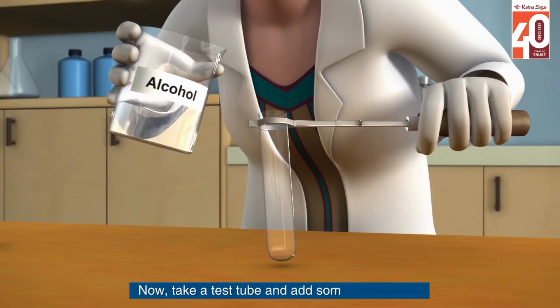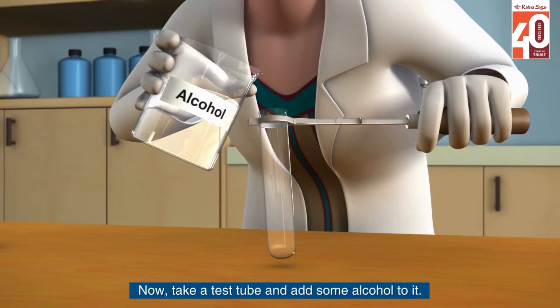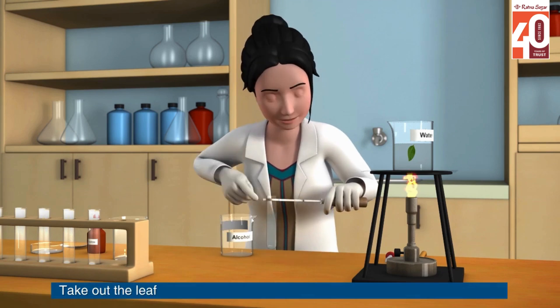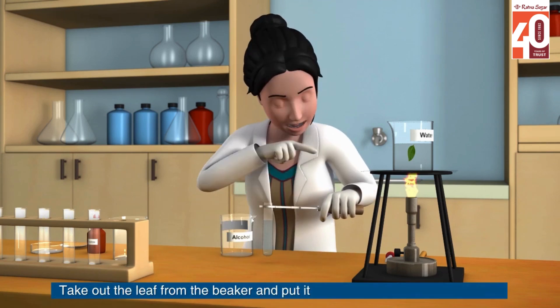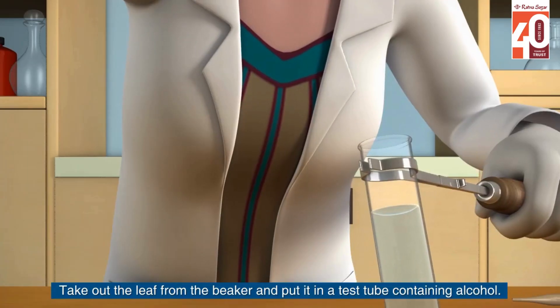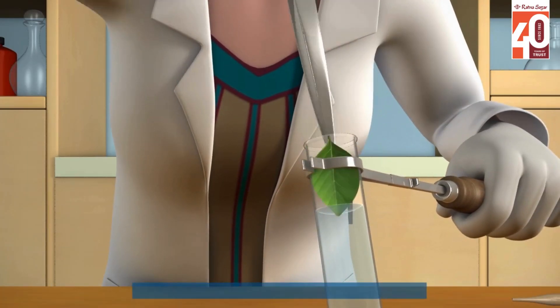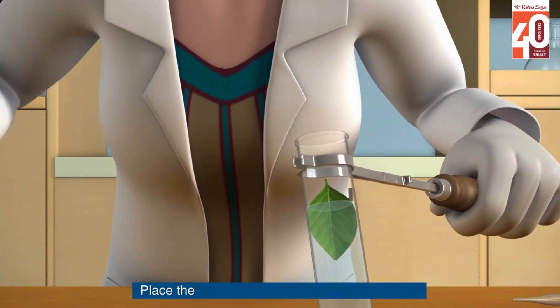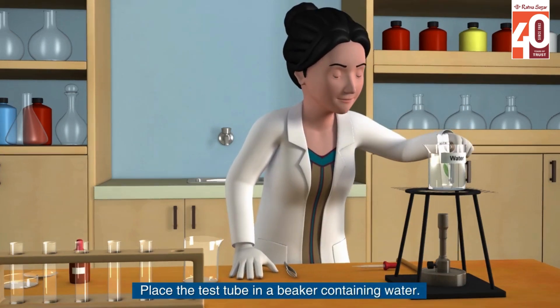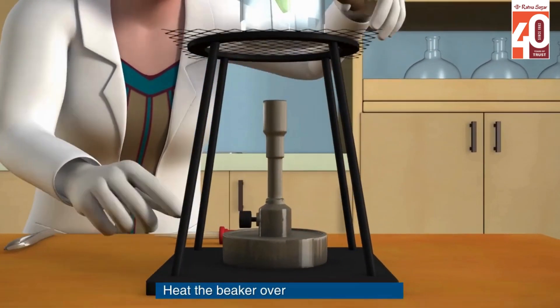Now take a test tube and add some alcohol to it. Take out the leaf from the beaker and put it in the test tube containing alcohol. Place the test tube in a beaker containing water and heat the beaker over the Bunsen burner.